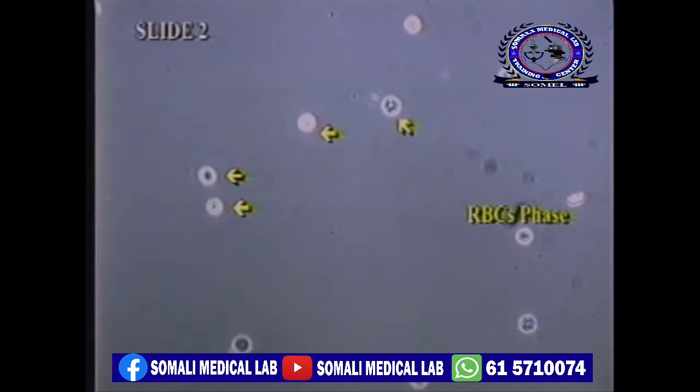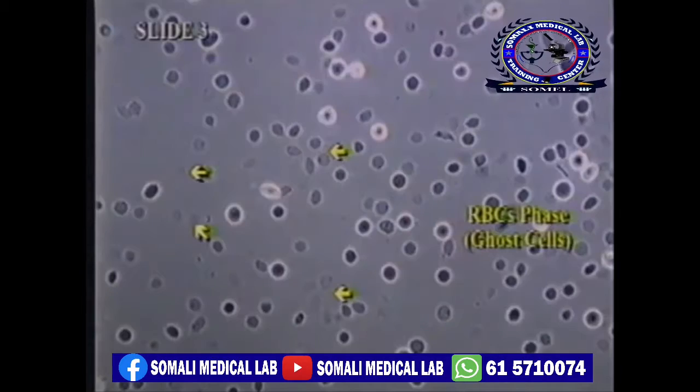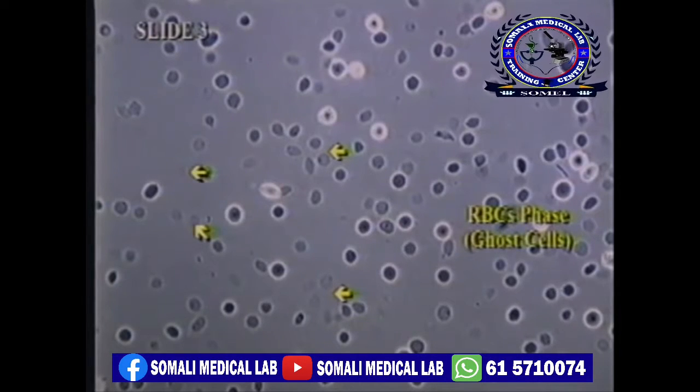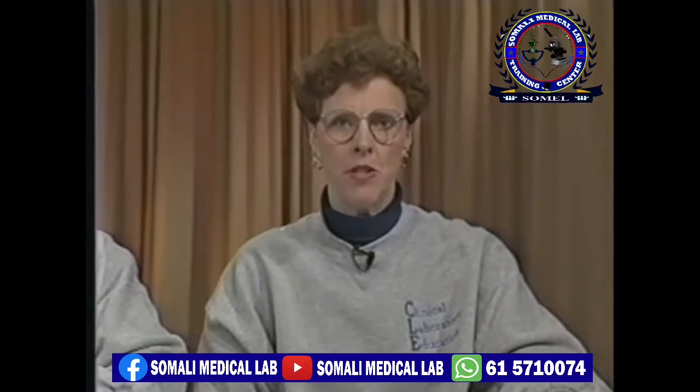During this section, some of the slides we will show you will be from phase, while others will be from routine light microscopy. There are a very few red blood cells seen in this slide. It would certainly be more difficult to see these without using phase. In this slide, under high power phase, we see something that is frequently missed under bright field. That is, ghost red blood cells. Without phase, the numbers reported would not be as accurate because of all the missed ghost cells. We will not address dysmorphic red blood cells since their evaluation is not a routine observation.